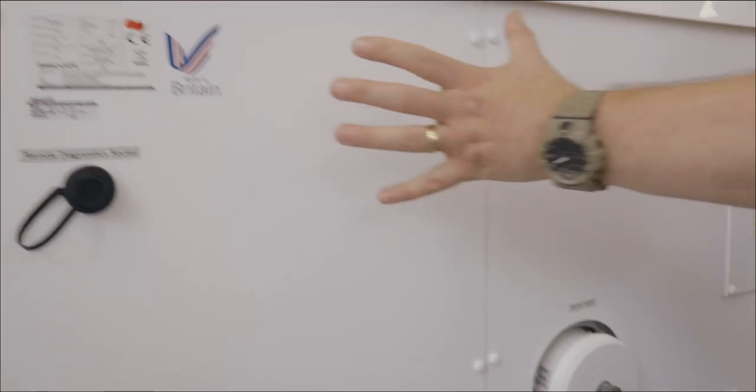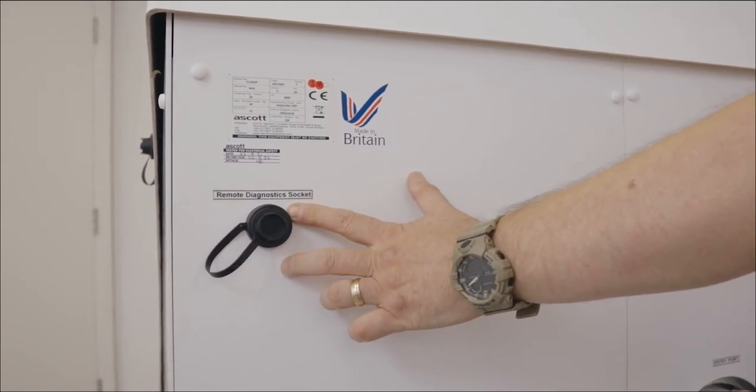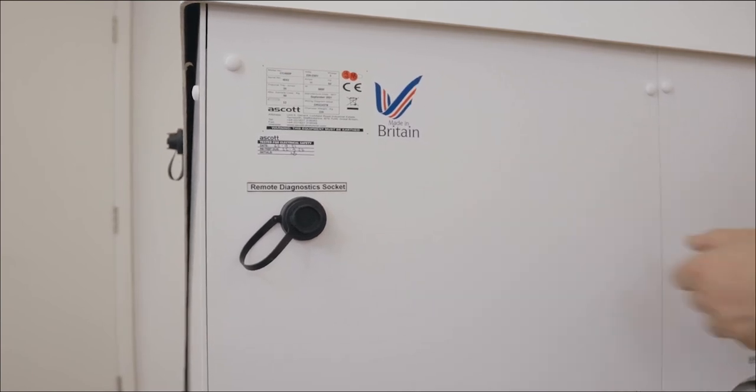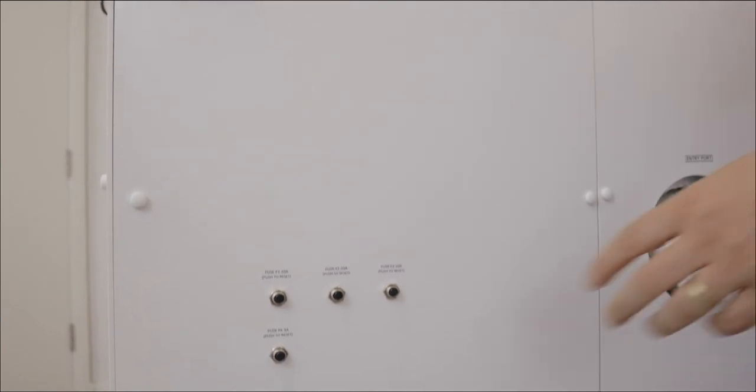To the left we have the main service panel. Here we have a remote diagnostic socket which allows ASCOT to access the chamber remotely via the internet for diagnosing faults and issues.